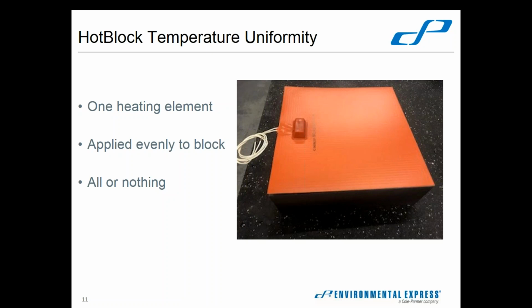Usually what happens is we'll get phone calls, somebody's trying to heat their block to 115, and it will never register above 75, because the mat inside has lost power to get any higher than that, and so the entire block will not be at temperature, not just one spot.